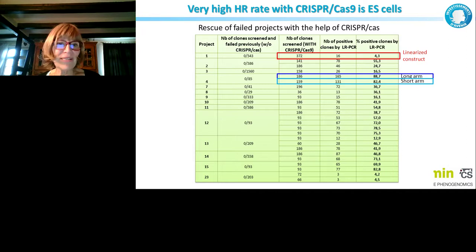Then I decided to use the same targeting construct, putting one guide, generating a double-strand break at the site of insertion of the neo, and you can see here the number of positive clones that you obtain. It's really a lot, and it's quite amazing how a simple guide RNA with Cas9 can change the number of positive clones we obtain.